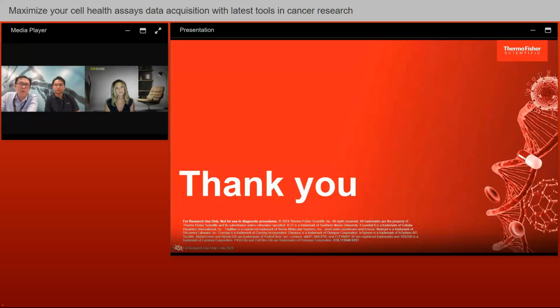For the StageView feature, the pins are identified to the location of the stage. The XY sensors identify that particular location, so changing the objective turret and choosing different objectives does not move the location away. You can be sure that once you change the objective magnification, you'll still be able to find the same location in the stage map.